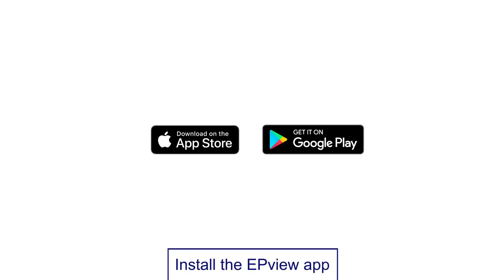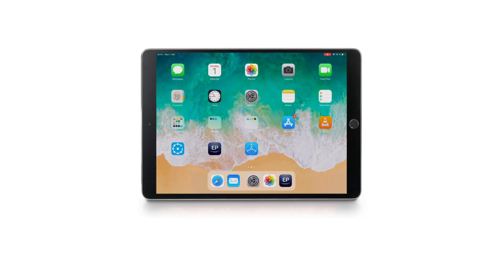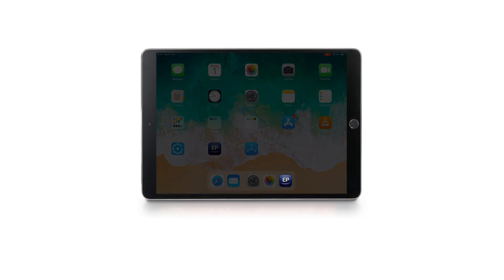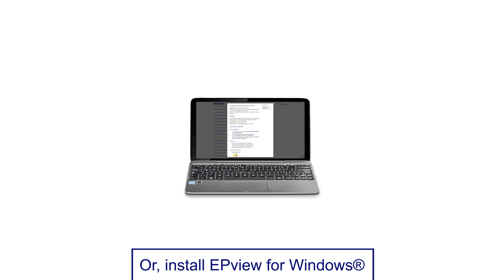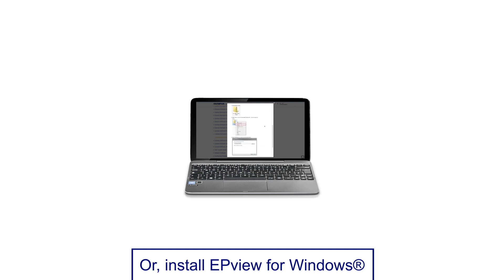First, for mobile devices, download the EP View app from the Apple App Store or Google Play, and install it on your smartphone or tablet. If you have a PC or laptop with a Windows operating system, install EP View for Windows, which is available for download on the Olympus website.